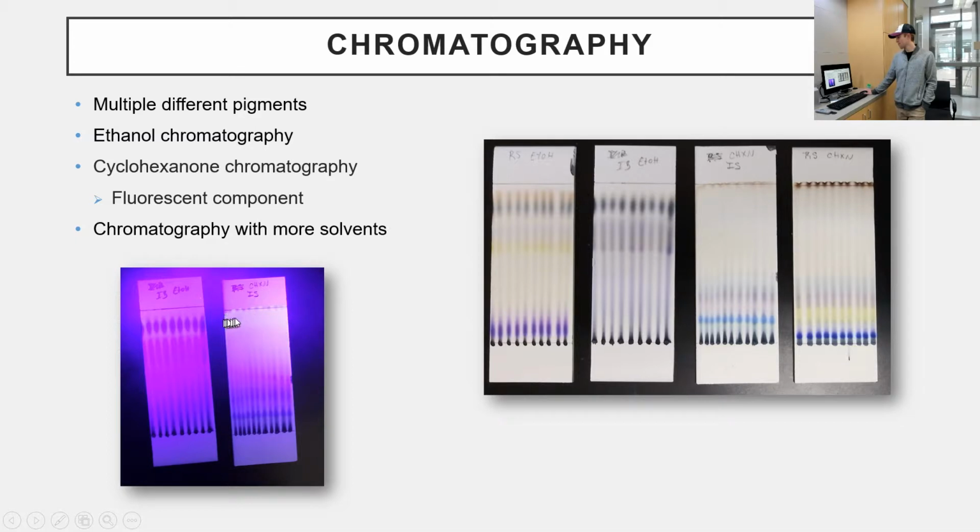Now you think that's from the Sharpie? Well, at first I was thinking it's dry. Yeah, it's dry. So the cyclohexanone's gone, but it could be the stabilizer from the solvent that's left behind. That was just precipitated as it evaporated. So as the solvent evaporated, maybe the stabilizer stayed behind, or it could be from the Sharpie.